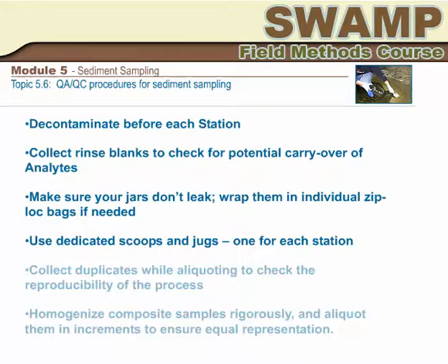If you use a sampler such as an Ekman, decontaminate thoroughly between stations and again at the end of the day. Then rinse it with clean water and collect the rinsate. This rinsate will be analyzed for the same analytes as the sediment samples.